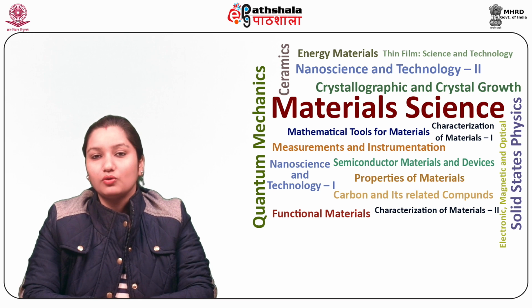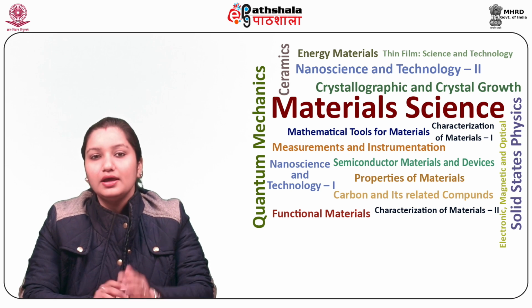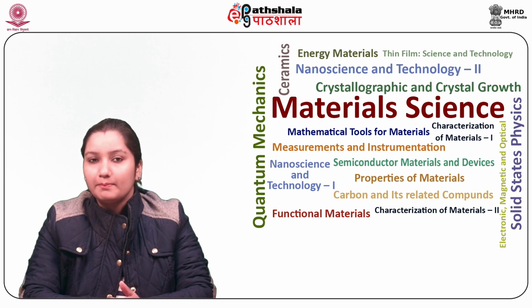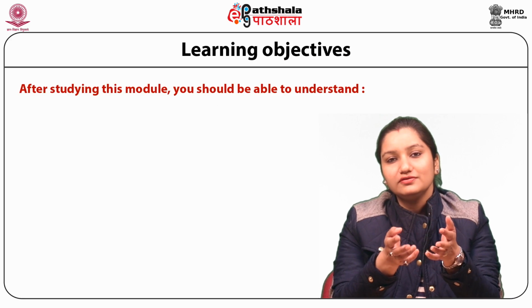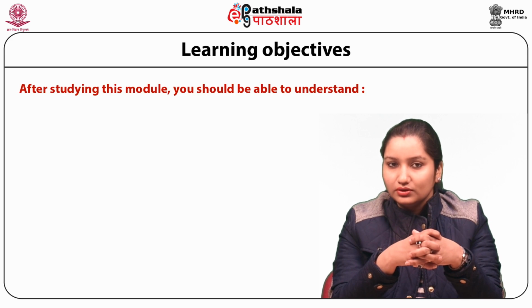Today we are going to talk on the module Fourier transform infrared spectroscopy, which is FTIR, principles and instrumentation under the paper Characterization of Materials Part 1. So students, let us see what we are going to learn in this module.